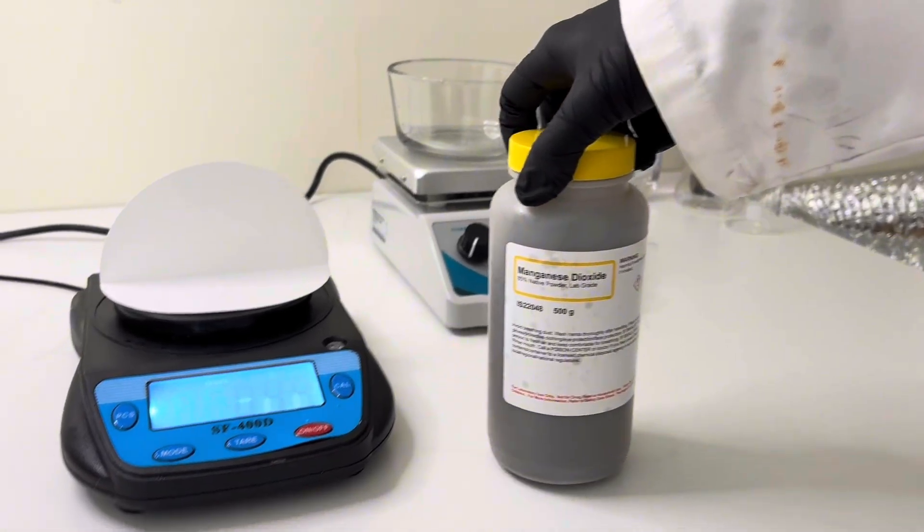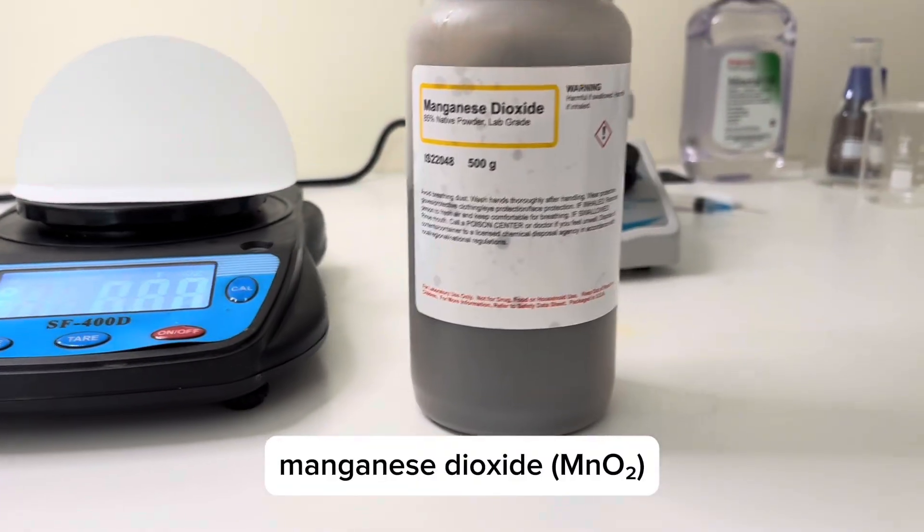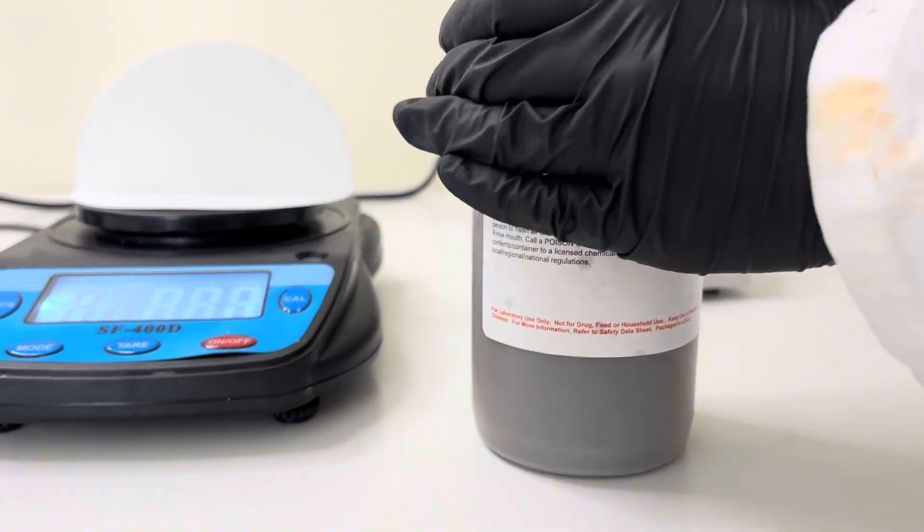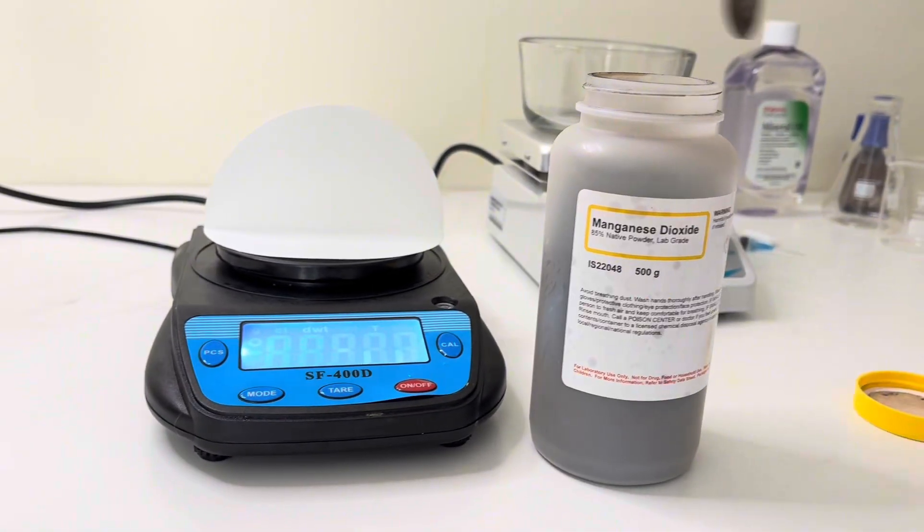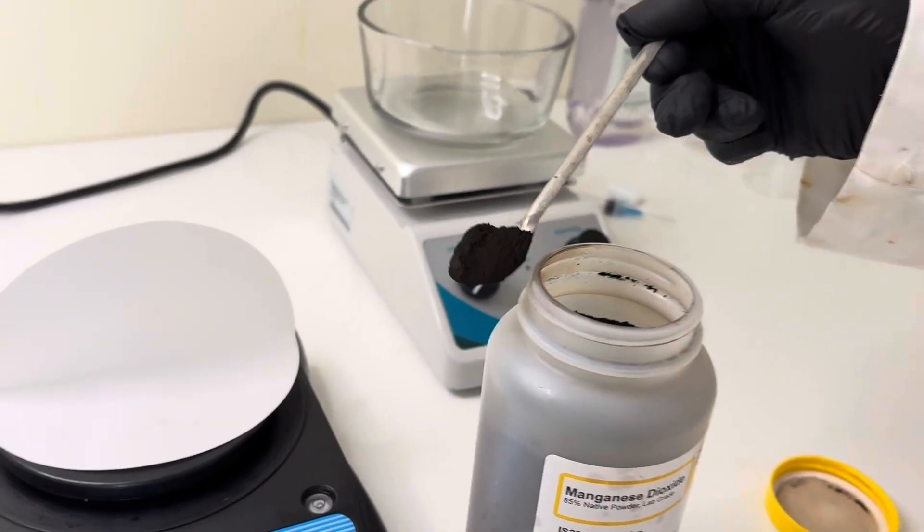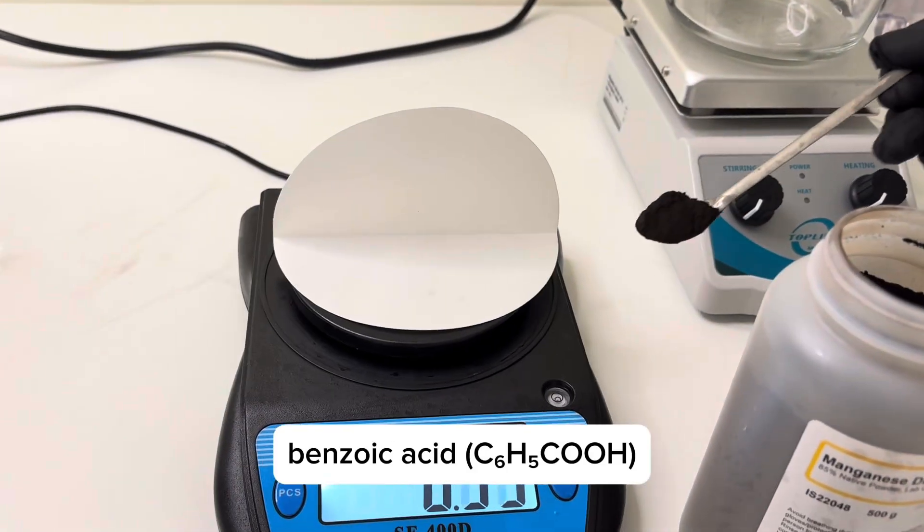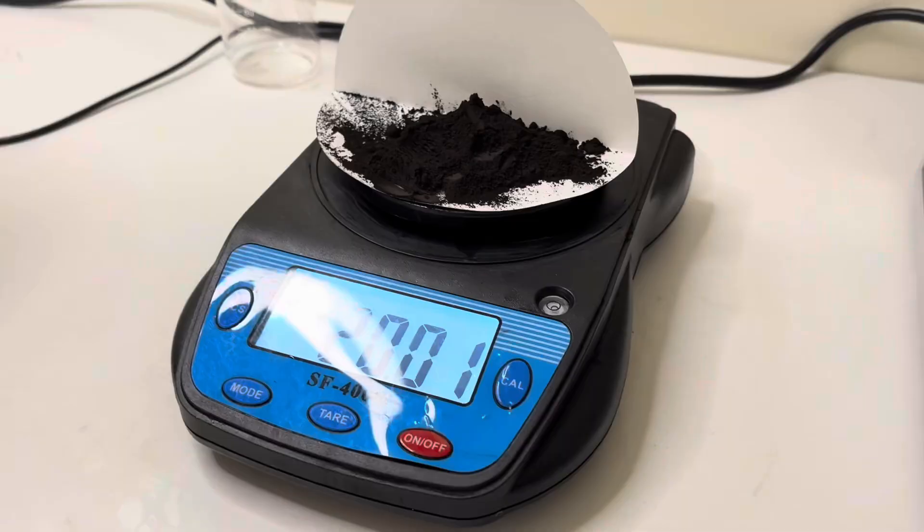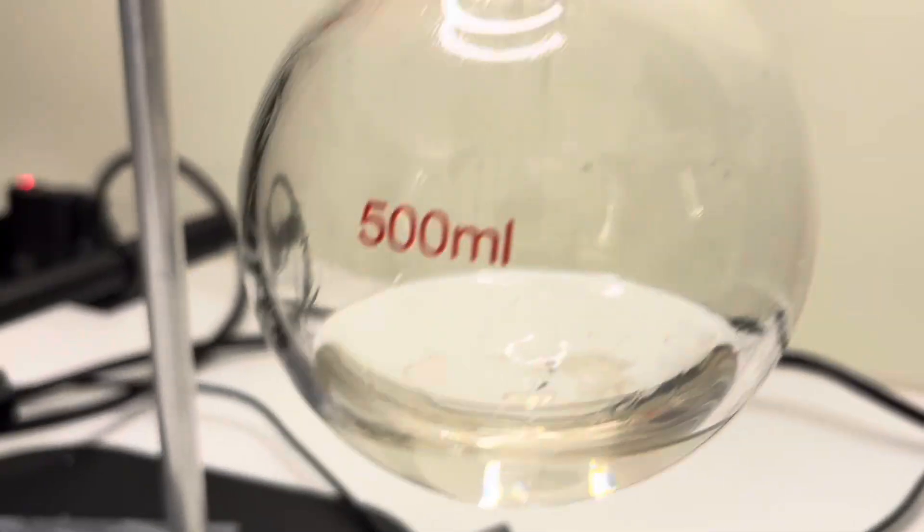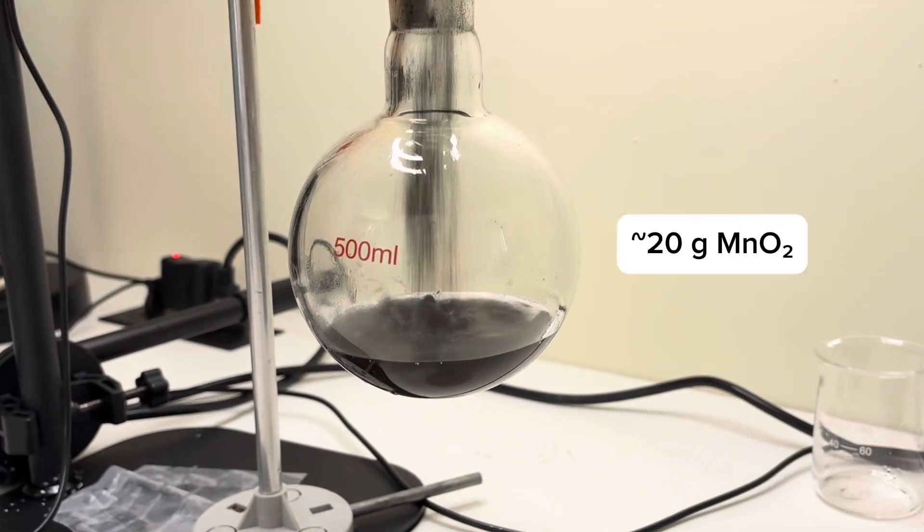For the oxidizer, I'm using activated manganese dioxide. It's a mild reagent that oxidizes primary alcohols into aldehydes, without pushing them further to carboxylic acids, like benzoic acid in this case. To ensure full conversion of the benzyl alcohol to benzaldehyde, I'll use 20 grams of manganese dioxide.